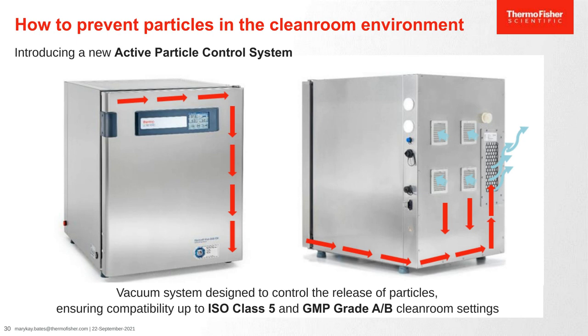And then there are also 4 passive intake air vents on the back, and those are indicated also, you see the shorter blue arrows where the air is coming in to cool the electronics and replace that outgoing air.